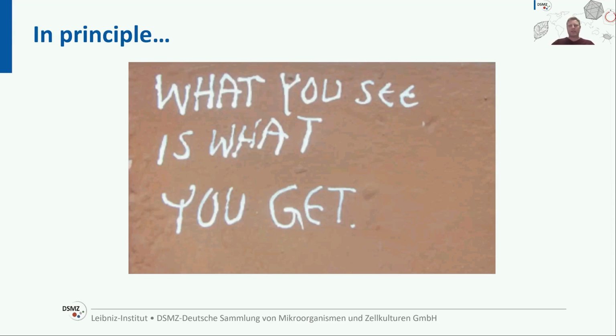When we are looking at tissue samples at the molecular level, we sometimes run into problems caused by fixatives like formalin. These chemicals, for sure, create crosslinks that make it tough to copy DNA or RNA. Science is always moving forward, and now we've got a new way to pull out and amplify genetic material from this tissue. Nevertheless, actually Christoph Sicking, our PhD student, now wants to present you a method which has been developed to avoid fixation.